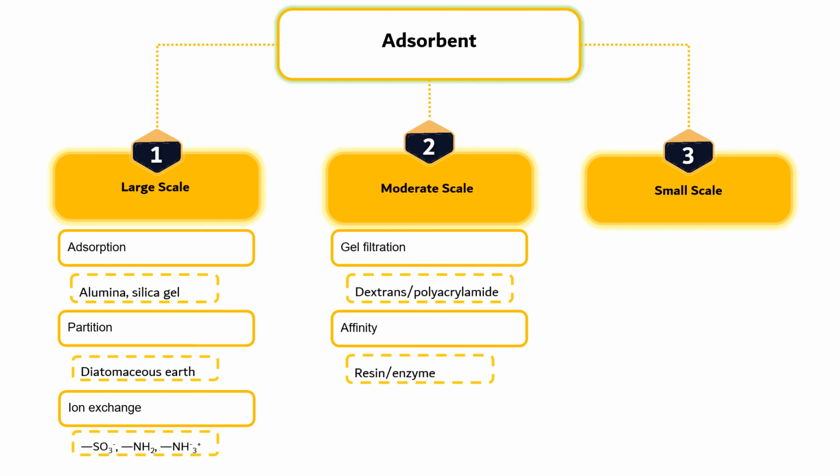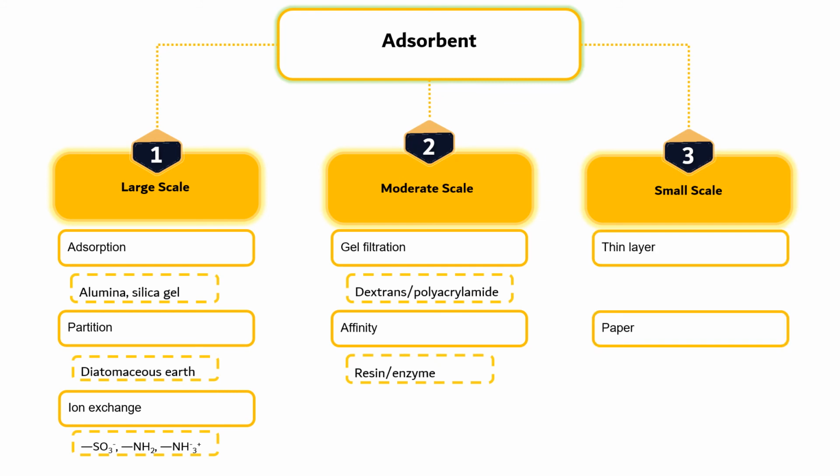For small scale, there are two types of chromatography, particularly thin layer and paper. For TLC, a small pulse of solute is placed on a plate thinly coated with alumina or gel. The plate is dipped in solvent, removed, allowed to drain, and stained to show the position and intensity of the solute pulses. The intensity is often assumed to be a measure of concentration.